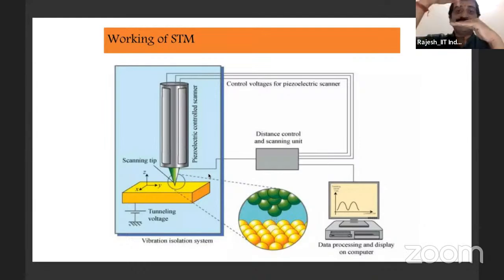Atomic force में क्या कहता है कि फोर्स मेजर करता है. अब फोर्स में क्या है कि अब जैसे अगर ये दोनों अलग अलग है, अब यहाँ से और यहाँ में और टच करने में कितना डिस्टेंस है, इसमें वो डिफरेंशिएट नहीं कर पाता. So the force it feels here and here, it may not distinguish well, but the tunneling current that comes from here and here, it can distinguish. So it gives a better resolution in STM or scanning tunneling microscope.